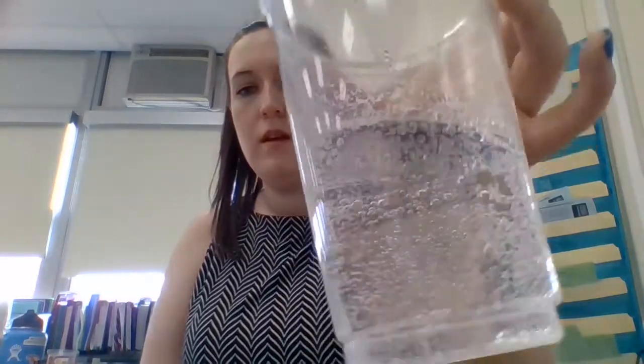And stop. Okay. All right, so it has fully dissolved and our time was 41.86 seconds.